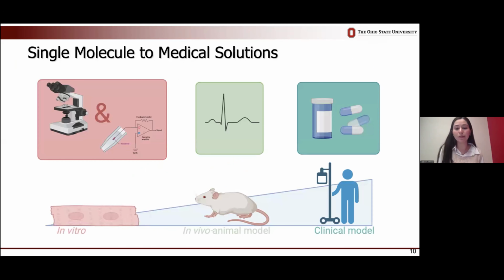Now, I would like to end my talk with re-emphasizing the importance of understanding sodium channel clustering at the single molecule level and the importance of MinFlux. Previously, other microscopy methods have not allowed us to get the information that MinFlux provided us. We weren't able to make distinct measurements about sodium channel density and about cluster sizes, and the capability of correlating this information with the functional results we received led to further insights into the structure and function relationship sodium channels have on whole heart electrophysiology. Now, this pipeline of starting here and moving all the way up to in vivo and clinical models spans beyond the scope of our lab and can be important to a wide variety of diseases and specific therapeutic drugs that want to be potentially tested.